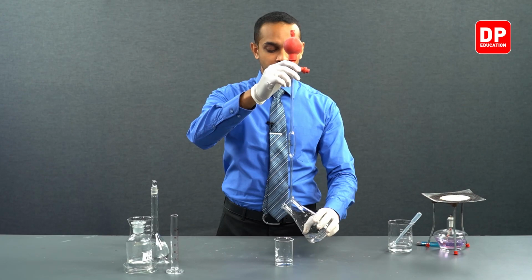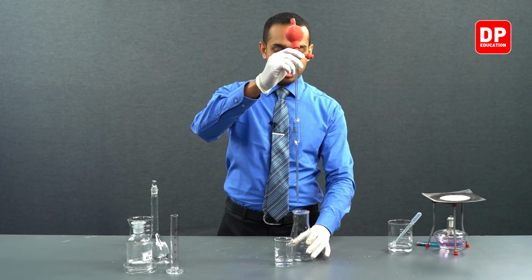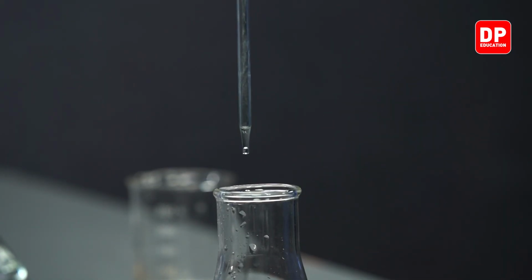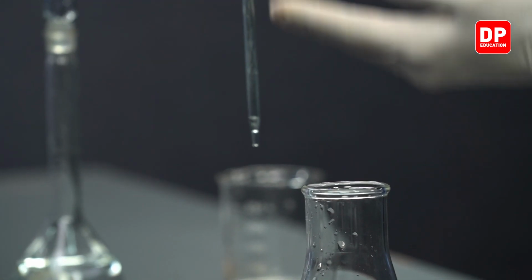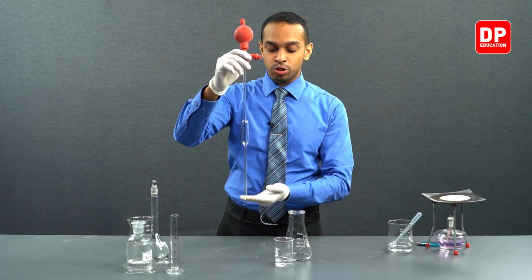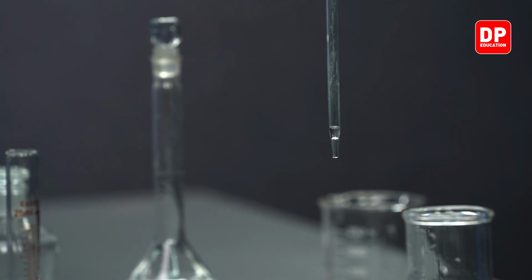After transferring all of the liquid, please make sure not to force out this last droplet that is present on the tip of the pipette. This droplet is supposed to be there because the pipette is calibrated in such a way that it is supposed to remain on the pipette itself.